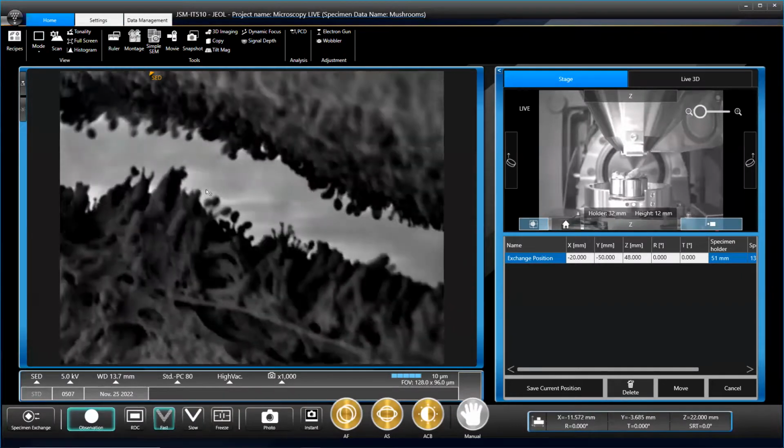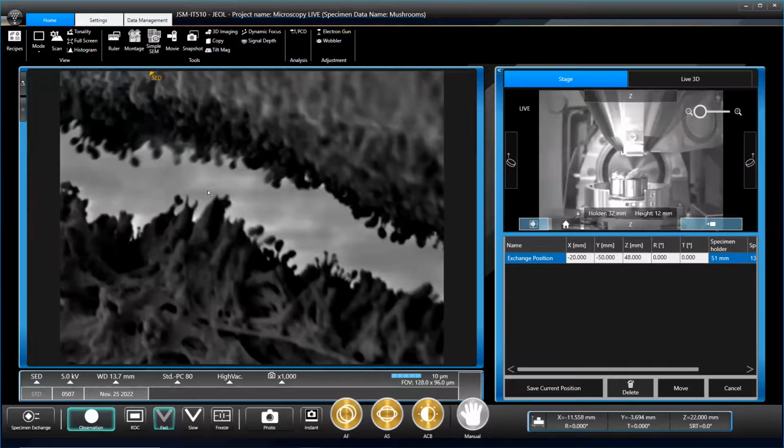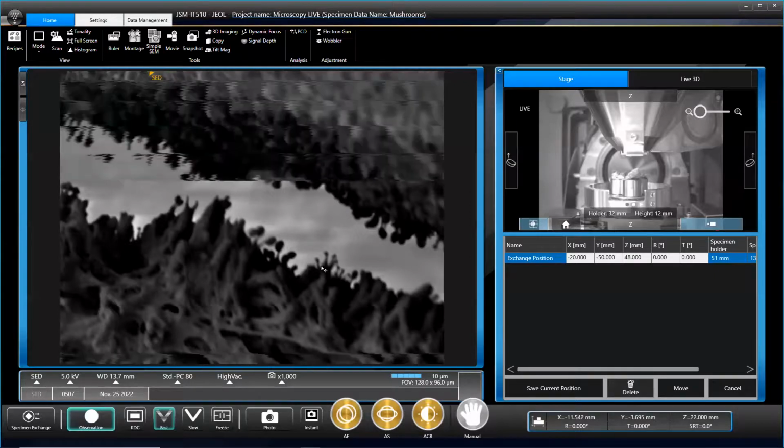The reason why there won't be so many spores here is obviously because they'll harvest them before they produce their spores. They look less appealing. If they express their spores, it just covers all the caps of the mushrooms that'll be growing next to them. So it doesn't look so great. Fine to eat, but obviously when they sell things, they want to sell things that look quite nice.